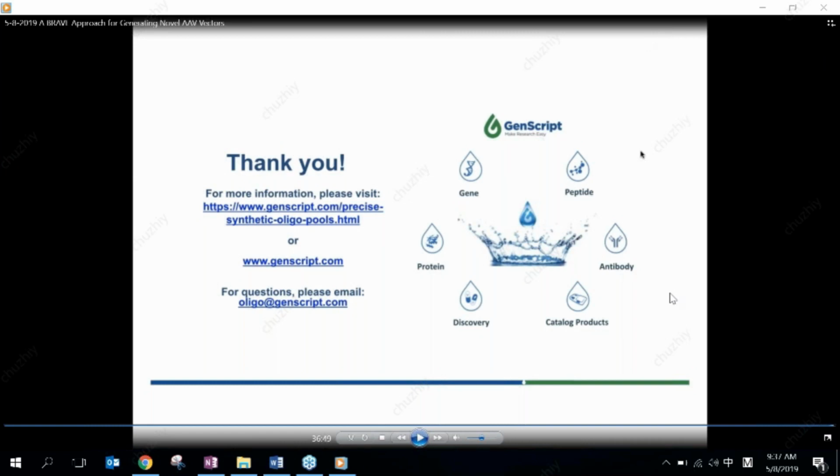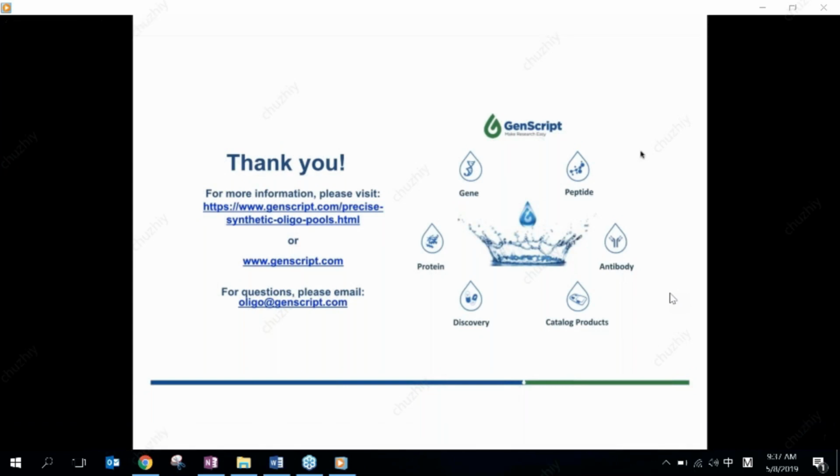That is a good question. The actual screen itself is about, I would say, 4 to 5 weeks. Most of the time-consuming part is to identify your proteins that will then generate these peptides that we insert in the capsid.